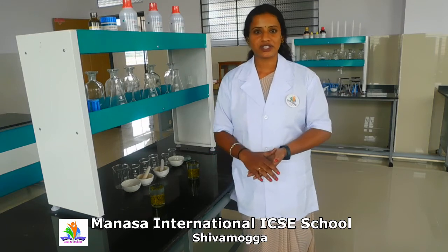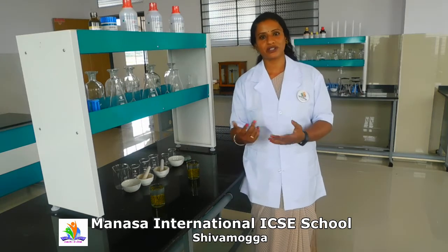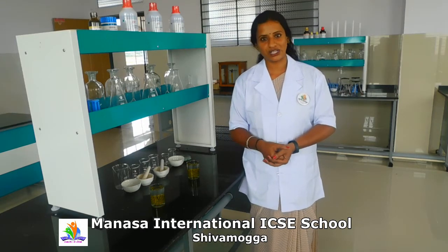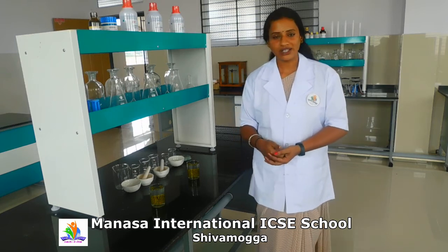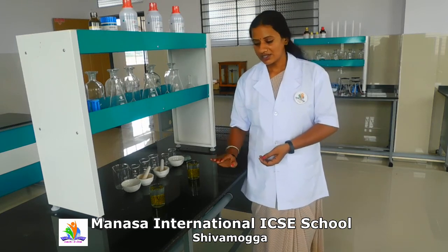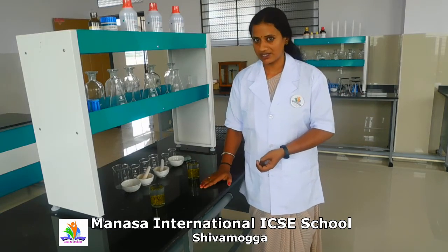So this is one activity. And one more activity, to know the difference between the temperatures of hot water, cold water and ice cubes, we shall conduct in the next class. So let's move on to the next topic. We just discussed the chemical laboratory infrastructure and what all the equipments are placed here.